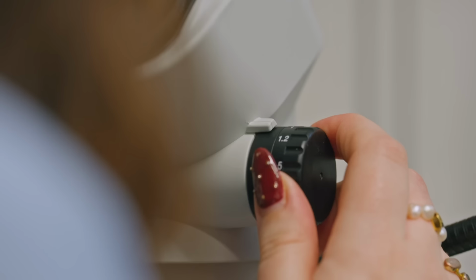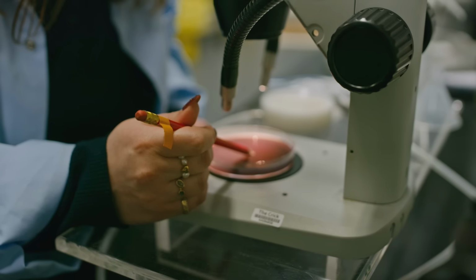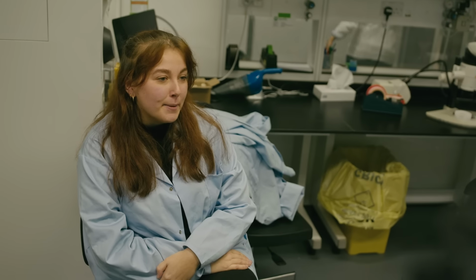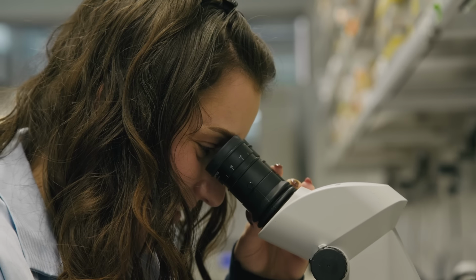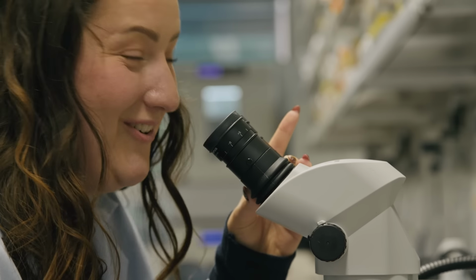Microinjections are precision injections under a microscope, adding DNA to tiny fly embryos that are only around 0.5 millimetre in length. Usually we'll inject about 200 every 40 minutes-ish. You're joking. That's just not possible. I can't even do 2 in like 10 minutes. Is this a bad time to say that it's a time-sensitive process? Oh, it is a bad time to say that. They're really small, which I know is obvious, but they're really small.